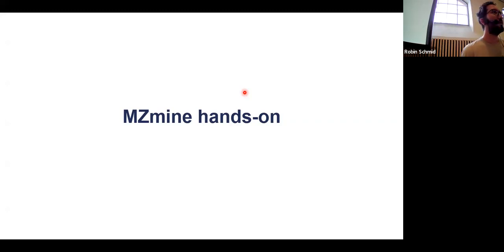Are there any situations where you would prefer XCMS over MZmine? Okay, the question was whether I would prefer XCMS over MZmine in any situation. I would definitely prefer it if I was already in an R environment, if I already have scripts to do downstream processing, and someone has already set something up, right?